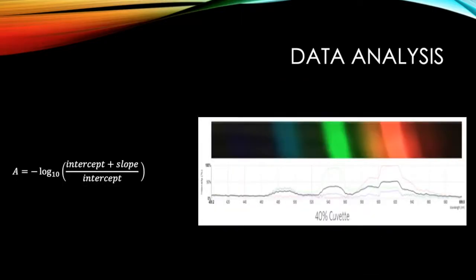Several wavelengths were chosen for examination based on finding wavelengths where spectra were defined, finding where reductions in intensity were most clearly defined, and avoiding wavelengths which exhibited recording problems such as overexposure. The chosen wavelengths were 437 nanometers violet, 490 nanometers cyan, 535 nanometers lower green, 557 nanometers upper green, and 590 nanometers orange. The red band was avoided due to high levels of overexposure.